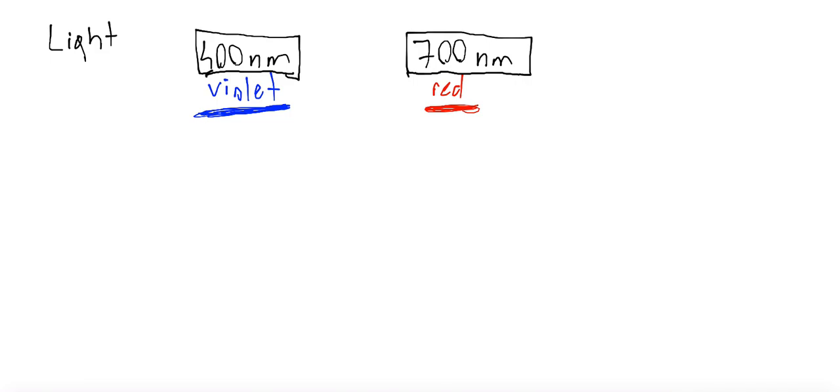Okay, so in the case of Blu-ray we can store more data because details are smaller, because violet or shorter light is used to read it. Okay, so normally, logically, for a stream of electrons, the wavelength must be much less than hundreds of nanometers because details which are seen by a typical electron microscope are much smaller. Okay, so copy this to your notebook.